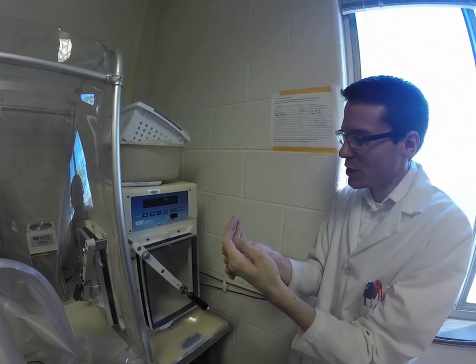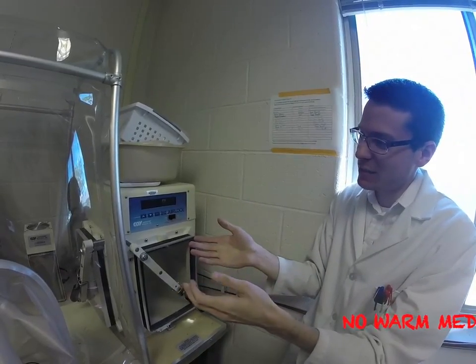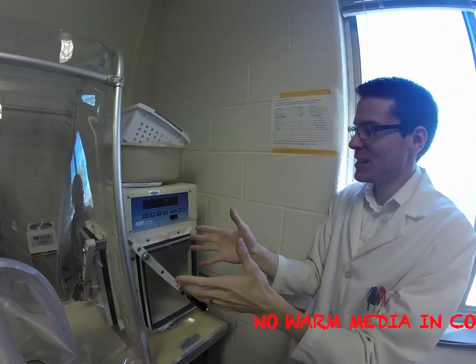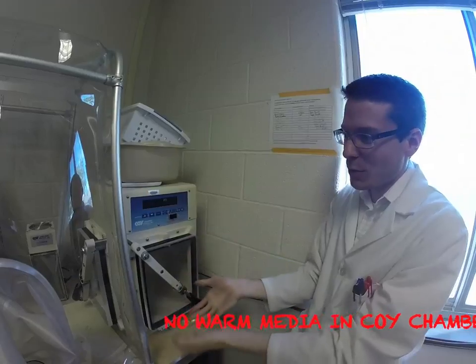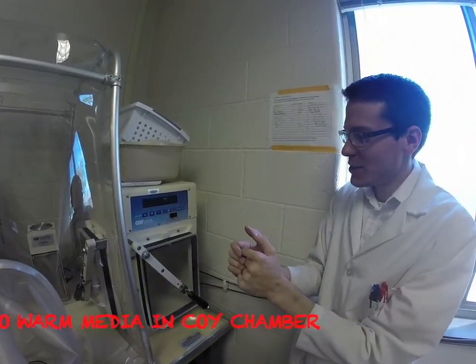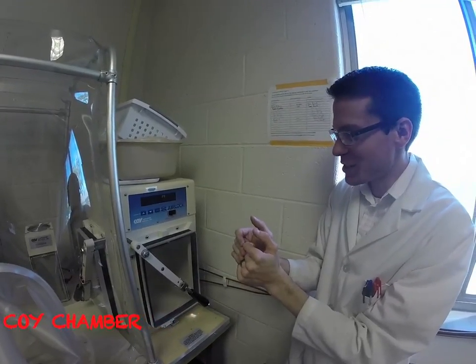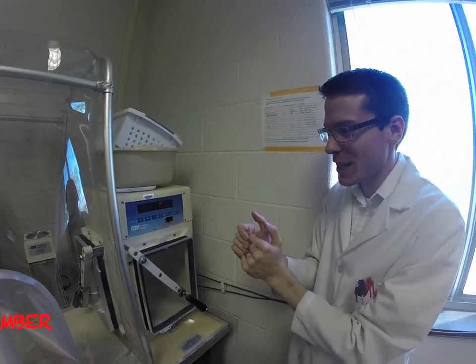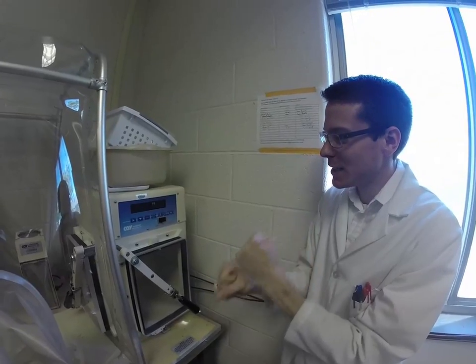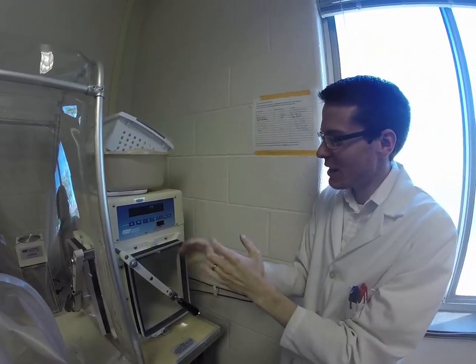If you were to ever bring warm media in here, so let's say you took something out of the autoclave and it was still decently warm, you need to remember that under low pressure inside of a vacuum it may have a tendency to boil, so don't do that because it's bad, and I know based on experience, so don't put it inside.